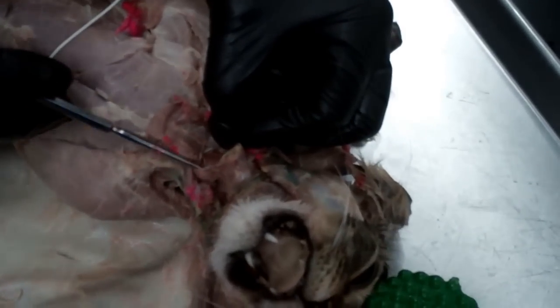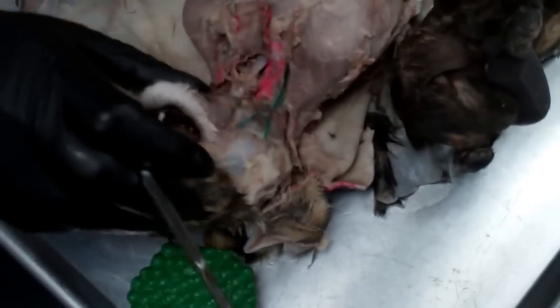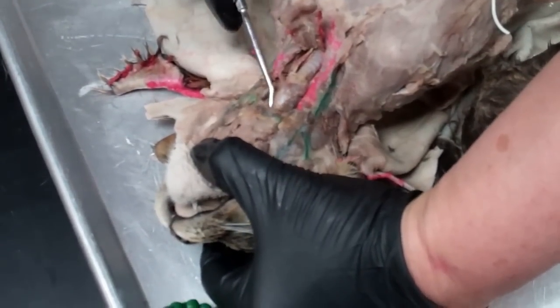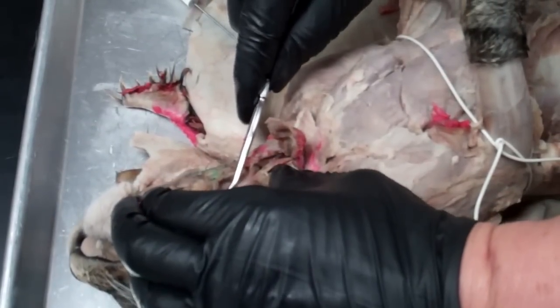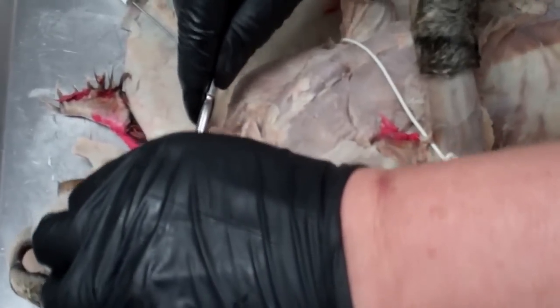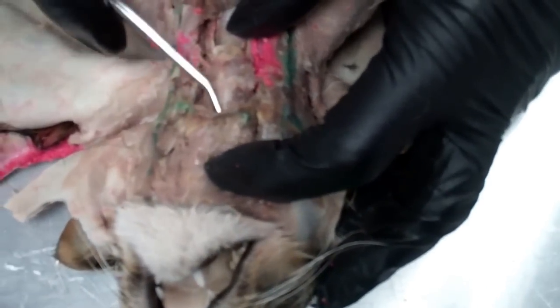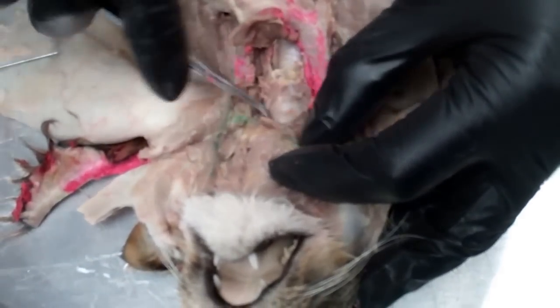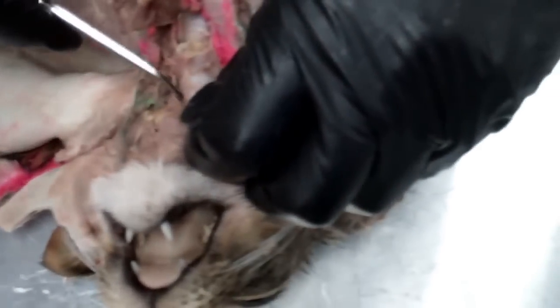The last thing we want to find is the epiglottis. It's a little tiny flap, and it's kind of tricky because it goes up underneath here. That flap is going to close down over the windpipe or trachea so that you don't get any food down there.